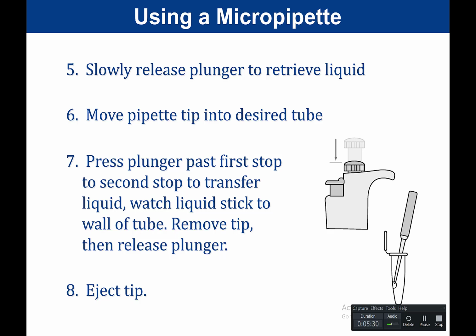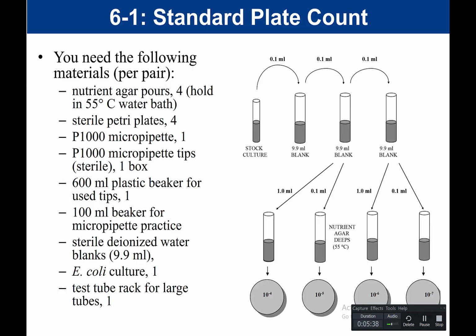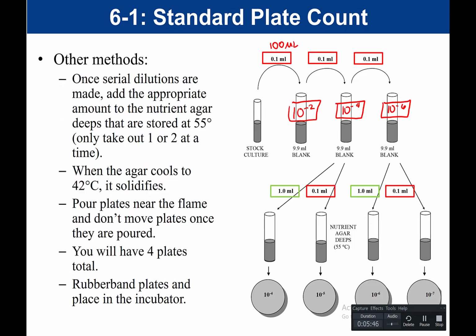So you should know the general steps when using a micropipette. There's nothing that you need to know for this part. You don't need to memorize the materials needed for this experiment. You should know an overview of some of the basics of the standard plate count.